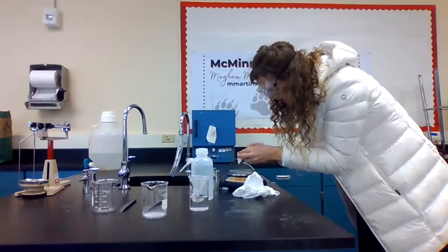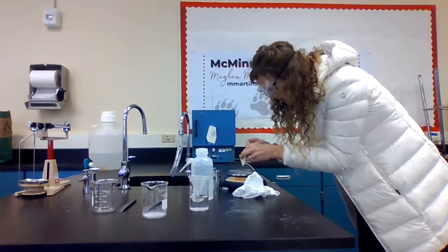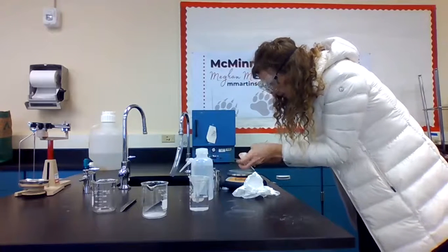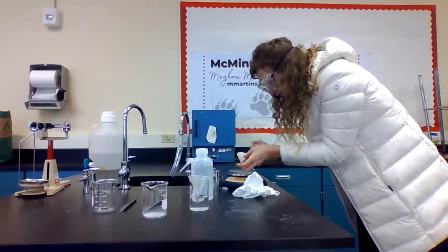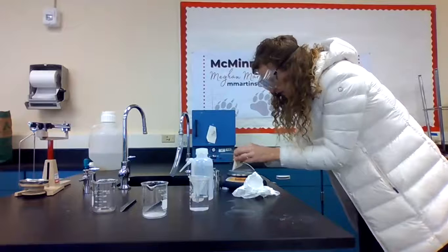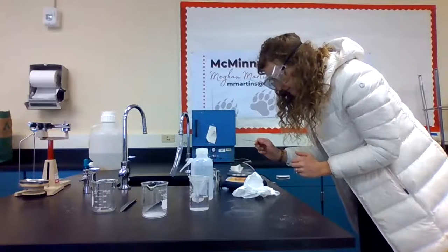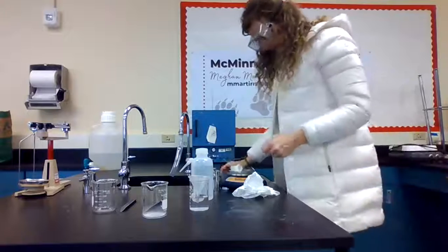Make sure we get all that solid back off the stir bar. Make sure we didn't lose any weight. 1.9. Okay.